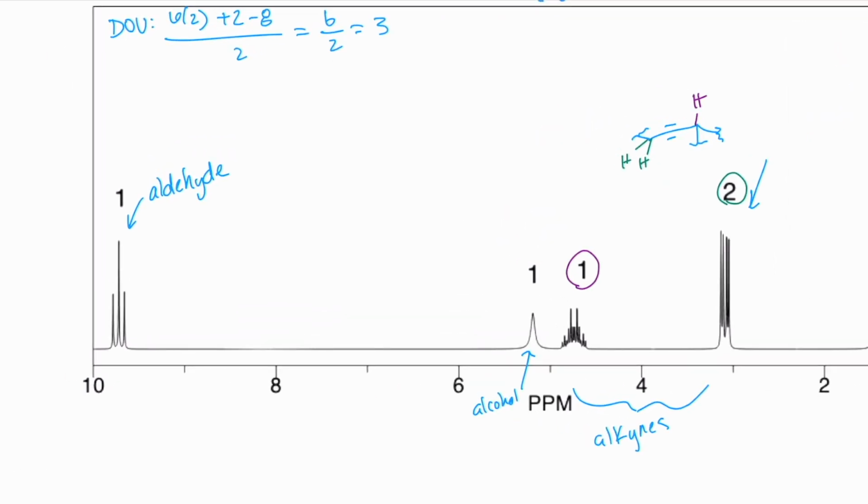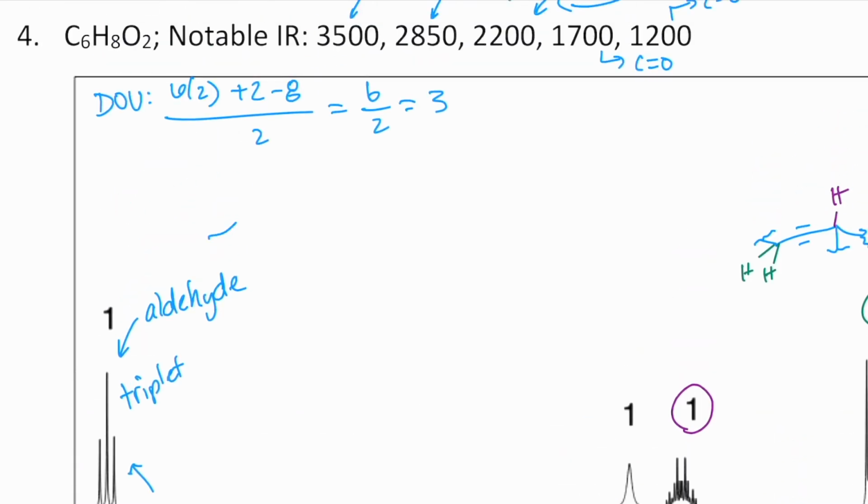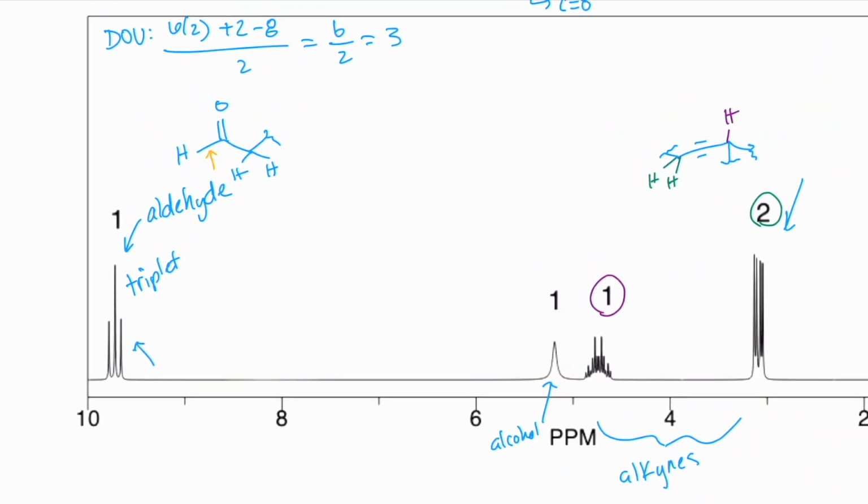But one thing we can do something with is the aldehyde with 2 neighbors. It's in a triplet. It's very common to see students think that aldehydes do not split because they think the carbonyl doesn't split through that. But it actually does because there's a CH bond. Oh, God, that voice cracked. So now if it's in a triplet, we must have that sort of thing. And look, we have 1, 2, 3. Okay, so they do actually couple through aldehydes. They do split through aldehydes.